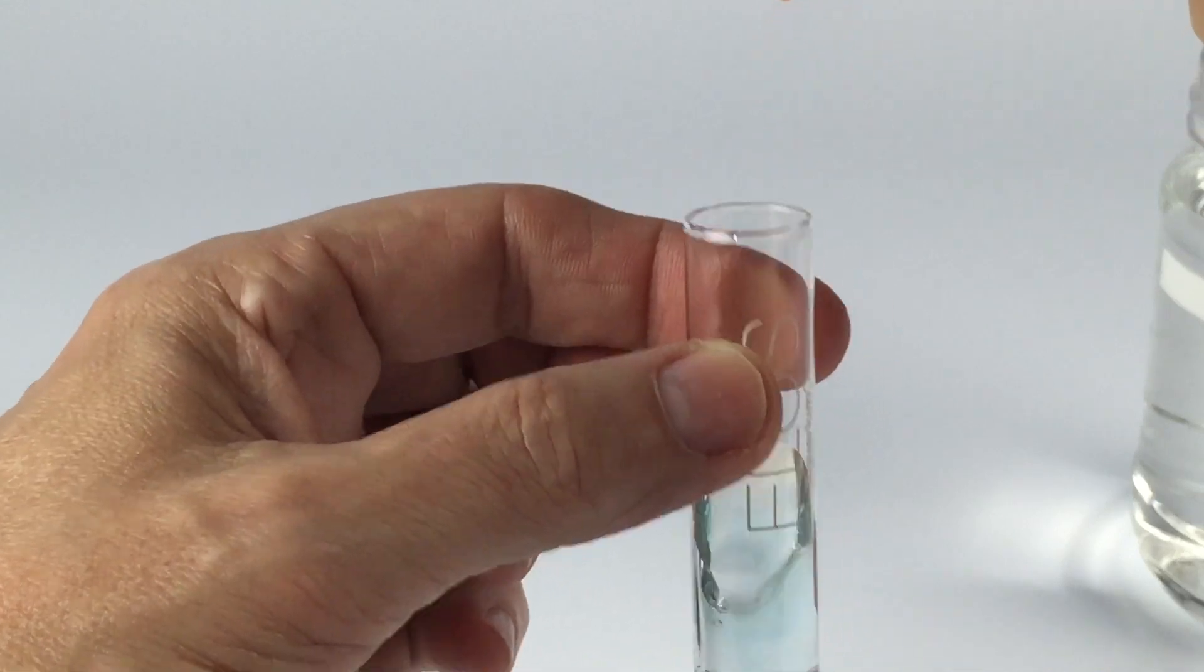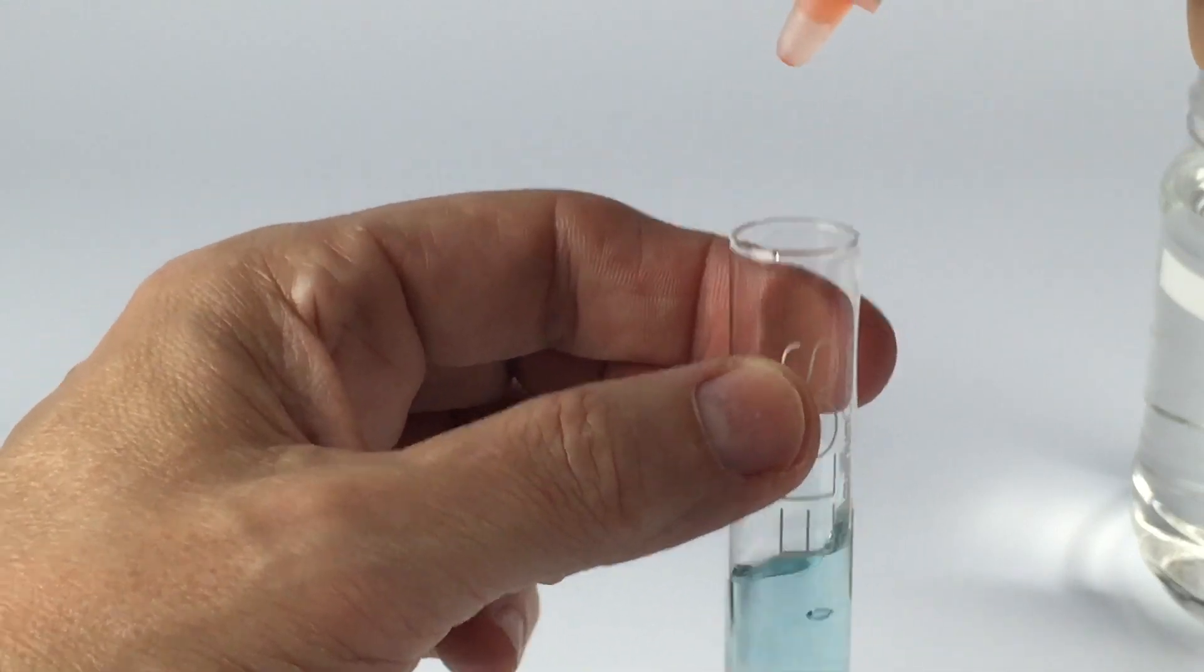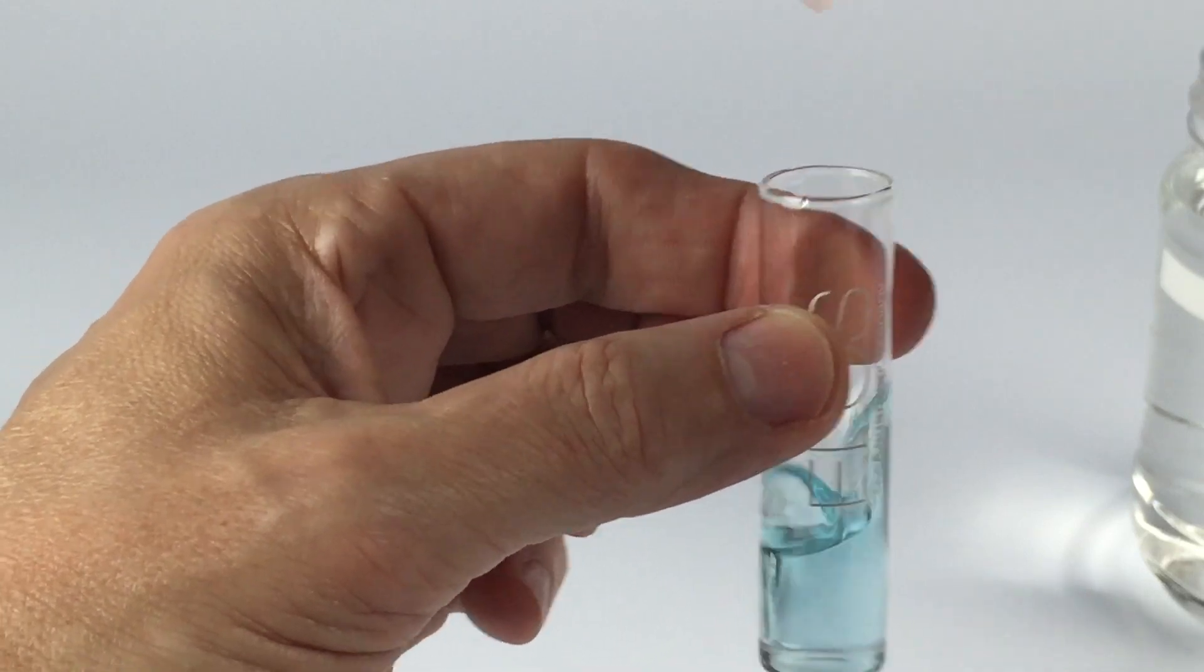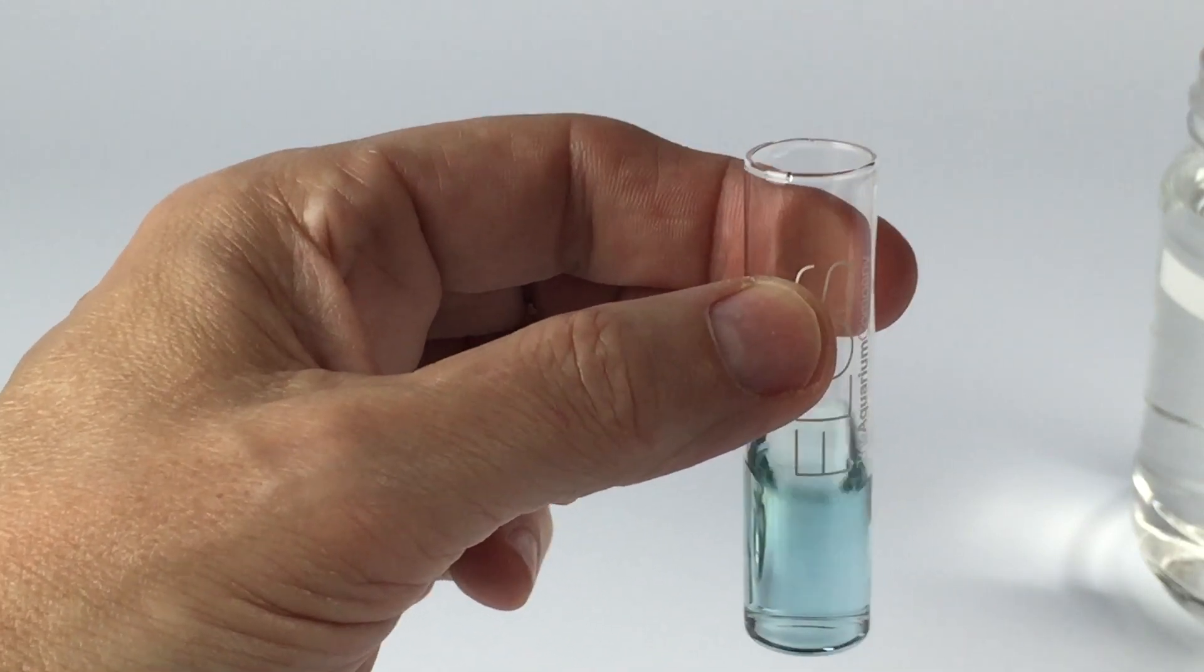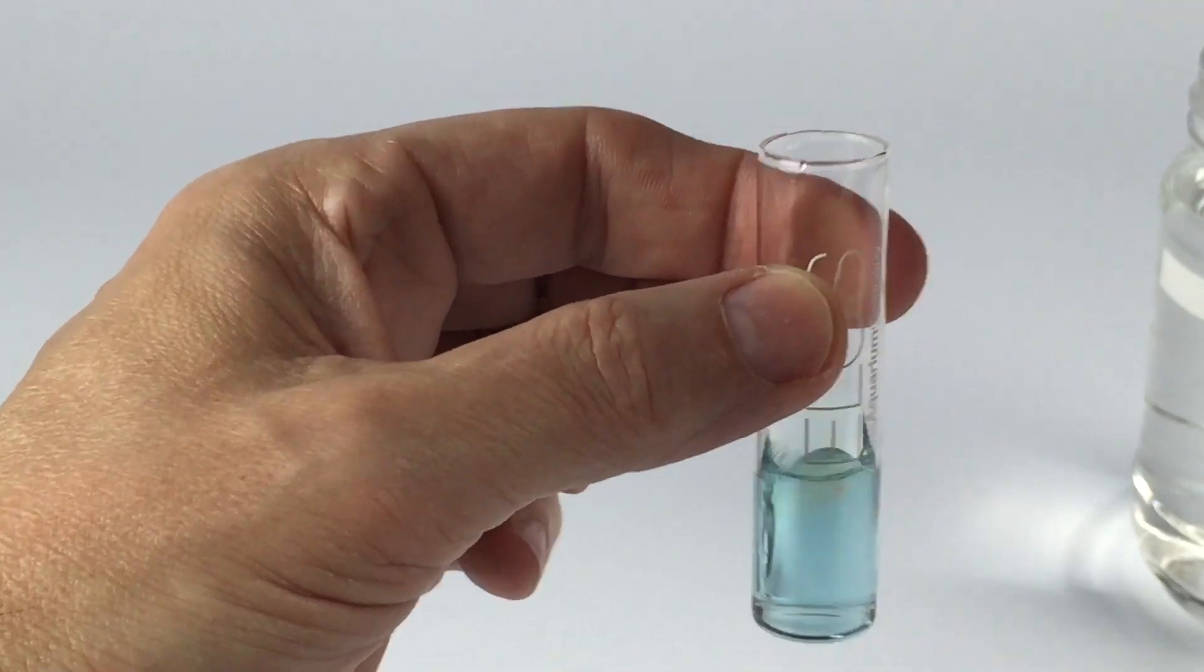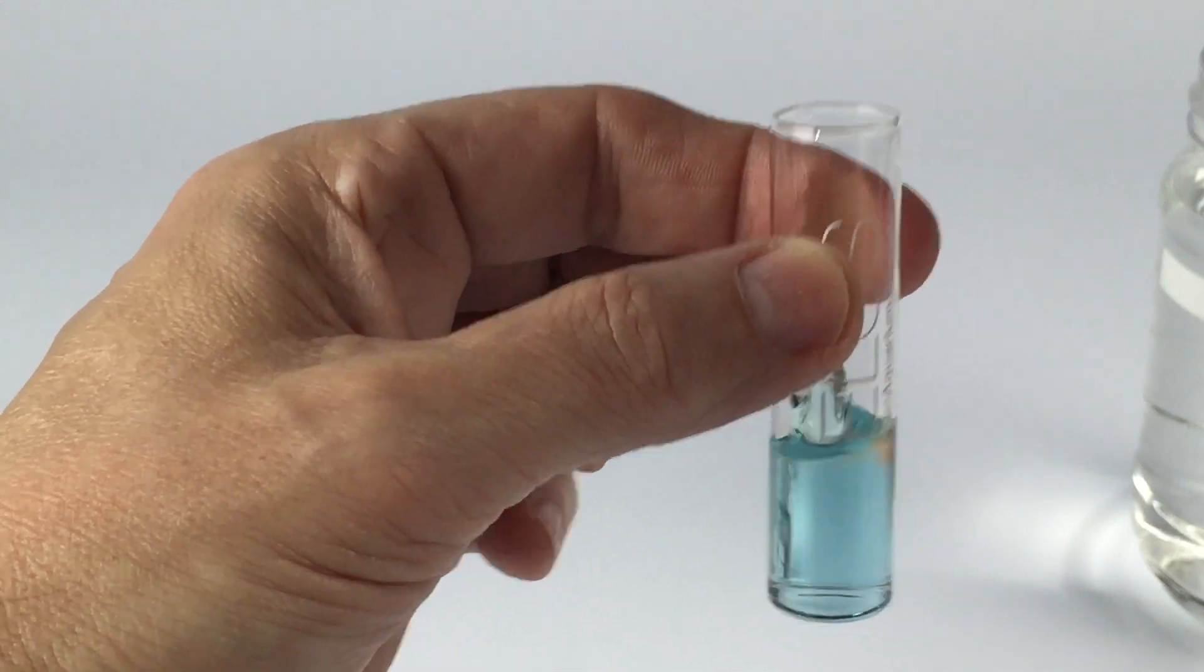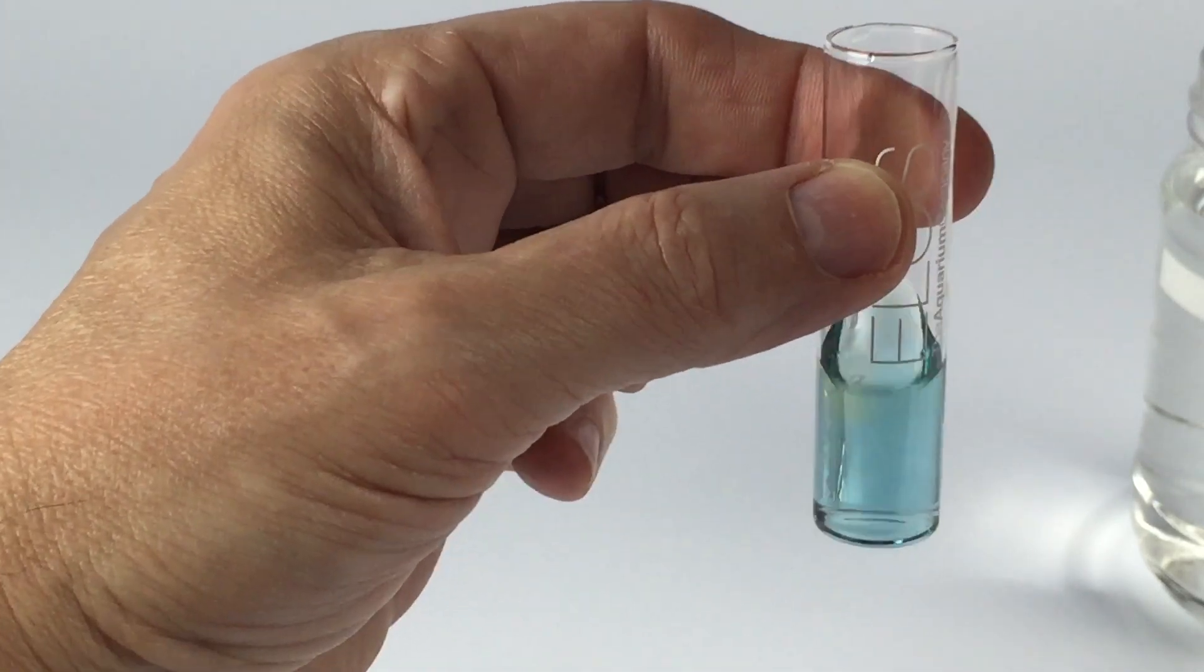As you add each drop to the solution you'll notice it becomes more and more blue until it hits that final tipping point where then it shifts over to an amber yellow color. What you want to see is when it comes to that color and stays that color. That will be your final product.